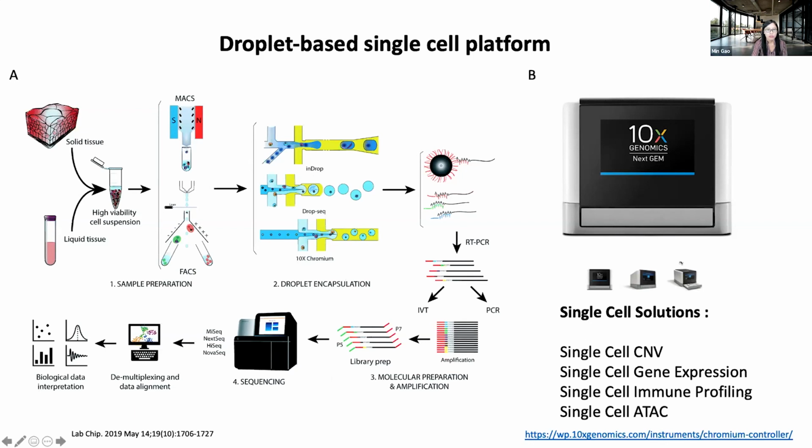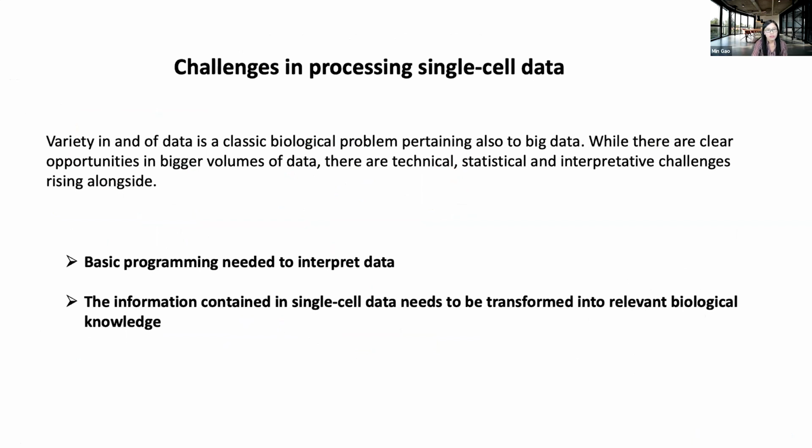Here shows the popular platform, the 10x Genomics single cell platform. Using this platform, we can do single cell RNA-seq, single cell DNA-seq, single cell VDJ-seq, or ATAC-seq. With the development of single cell technology, we generate a lot of single cell data. That is an opportunity for us to make great biological discoveries.